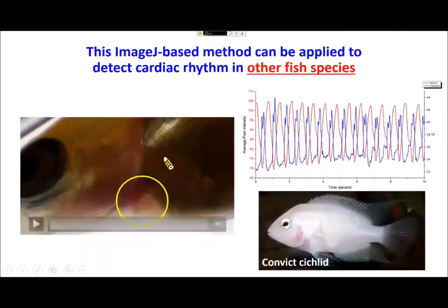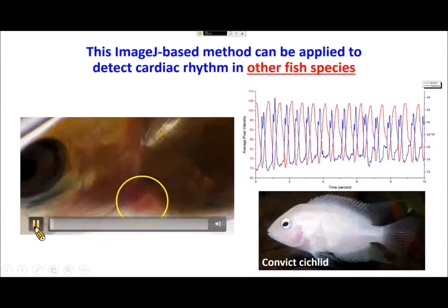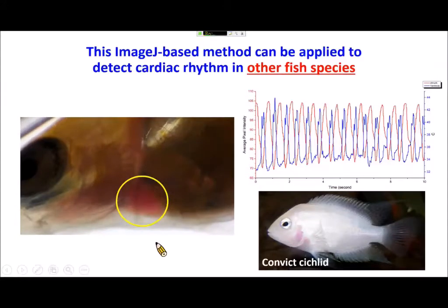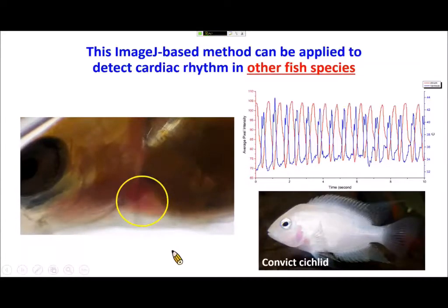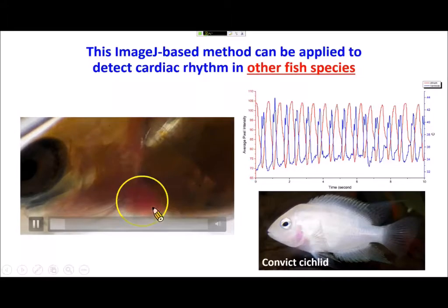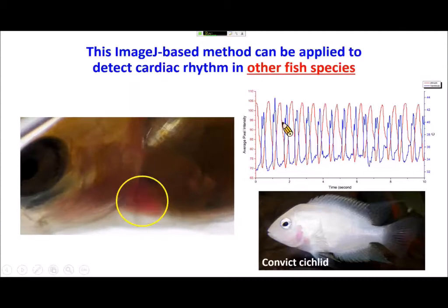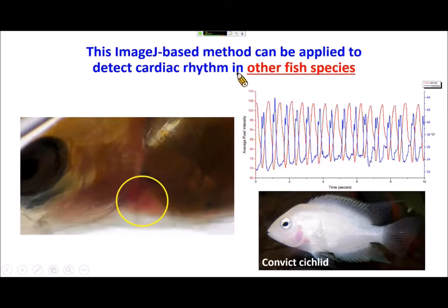We also applied this methodology to other fish species — for example, a fish similar to the convict cichlid. In the embryonic stage their embryo is also slightly transparent, so we can still see the atrium and ventricle. Using our algorithm, we can nicely detect atrium and ventricle beats. The conclusion is this method is not only applicable to zebrafish but also to other fish, helping many researchers start using this simple method.